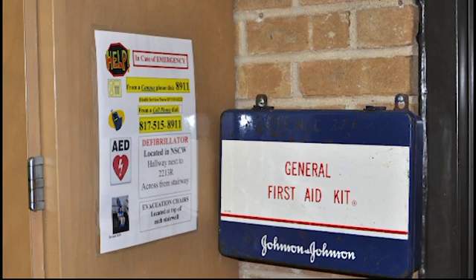Cuts, burns, or other accidents that occur during the lab must be reported to determine if further action is required, such as calling the nurse or other safety personnel. Take all precautions to avoid such accidents. Students with prior injuries or health problems must notify the instructor before the lab begins to determine whether the student can safely commence with any lab work. In some cases, signed doctor's notes may be required to allow the student to safely continue in the lab following a serious illness or other significant health problem.